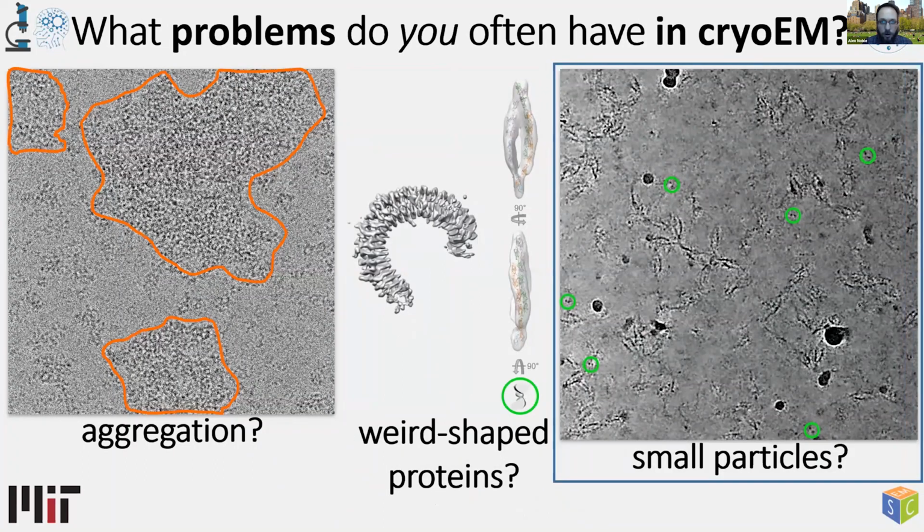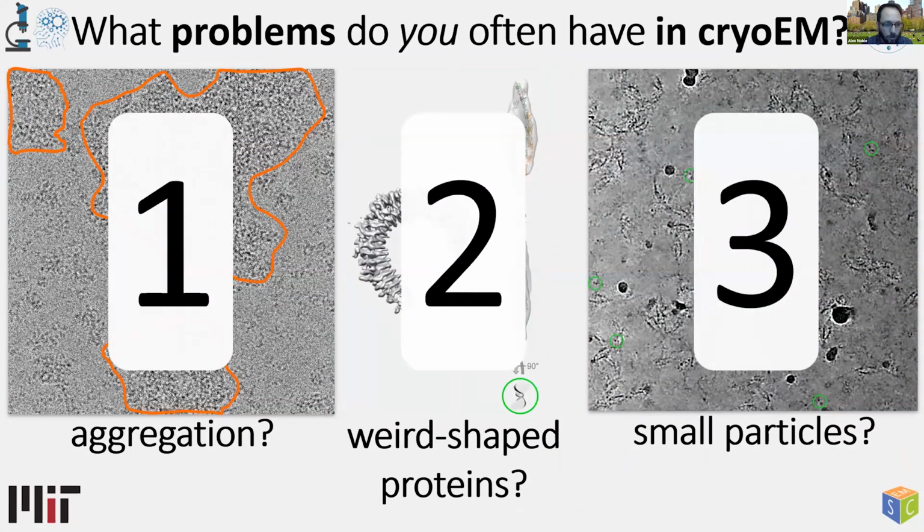So the interactivity part here is if you have any one of these problems with any of your current samples, please type some combination of 1, 2, or 3 in chat. I like to have a good idea of the types of problems people are having and who I'm talking to, and keep your questions in the Q&A. So this will flood out the questions inside of the chat.